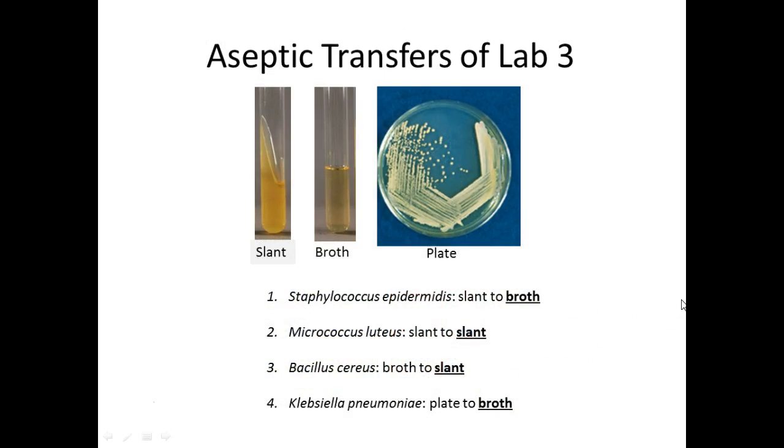So again, this is the plan for today, right? Which actually is kind of written out on the labels on our tubes, right? So I'm just going to follow that because I'm going to turn off this light so that you guys can come up front and watch me actually do the transfers. Then you're going to go back to your lab bench, and as I said, you're going to work in pairs next to each other. One person will do the aseptic transfers while the other one watches, and then you'll switch. The other side of the lab bench will use the mixed culture and do their streak plates, and then you guys will switch. Okay? Let me turn off this light.